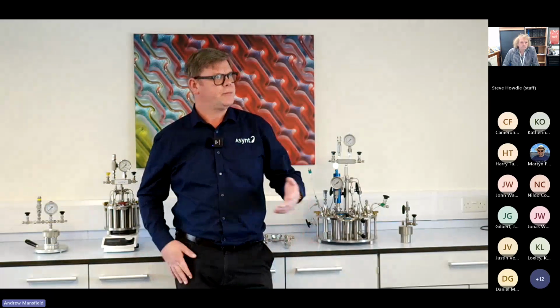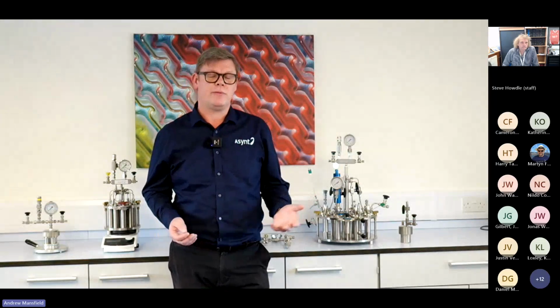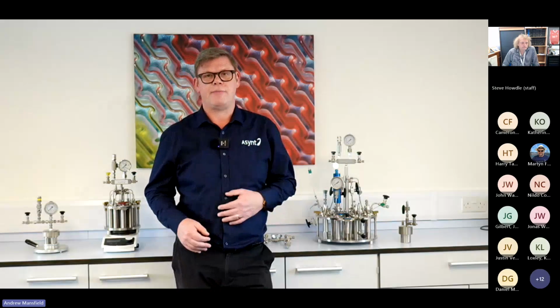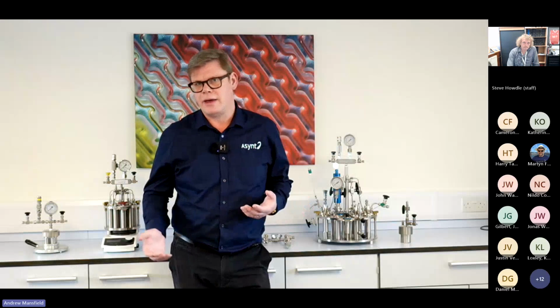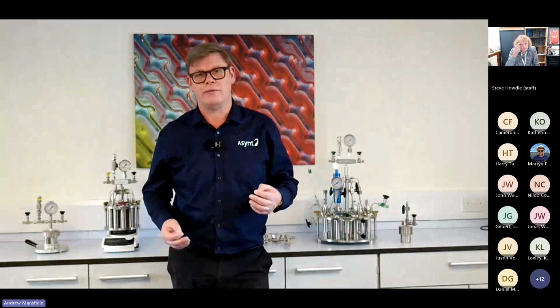But today we're going to be introducing the concepts of how to use pressure reactors and run pressurized reactions at high temperatures and pressures. So we're going to give a brief introduction to some examples, some of the pitfalls that we can find.